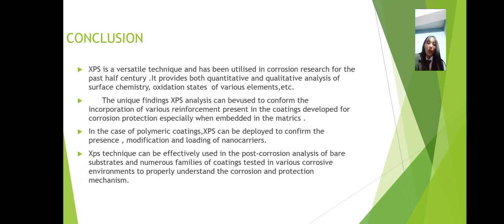It provides both quantitative and qualitative analysis of surface chemistry, oxidation state of various elements, etc. XPS analysis can be used to confirm the incorporation of various reinforcements present in the coatings developed for corrosion protection, especially when embedded in the matrix. In the case of polymeric coatings, XPS can be deployed to confirm the presence, modification, and loading of nanocarriers.